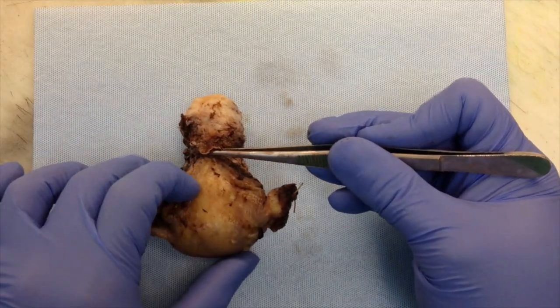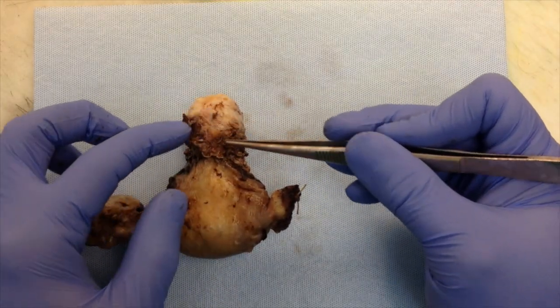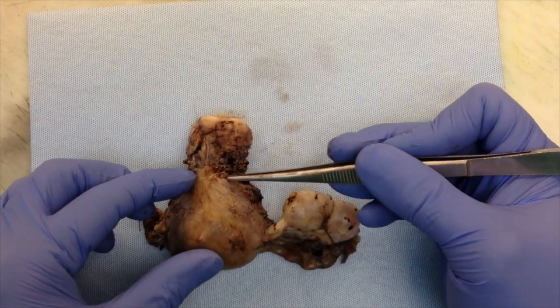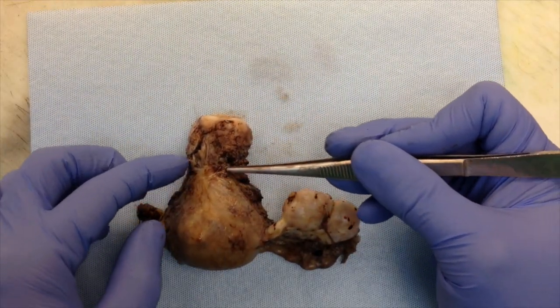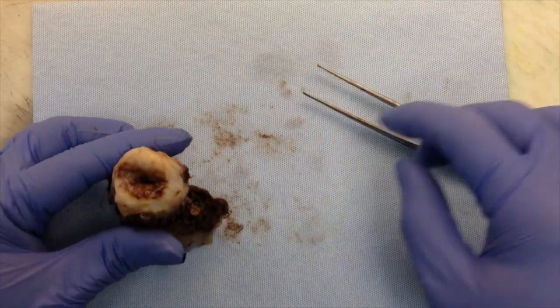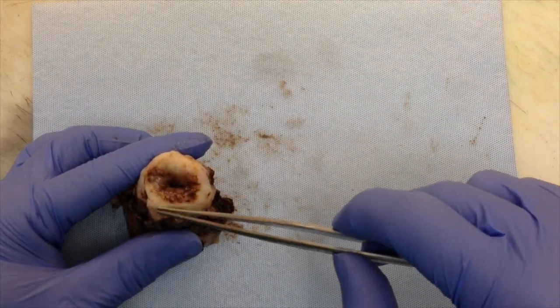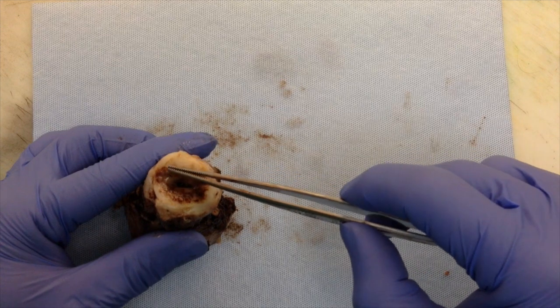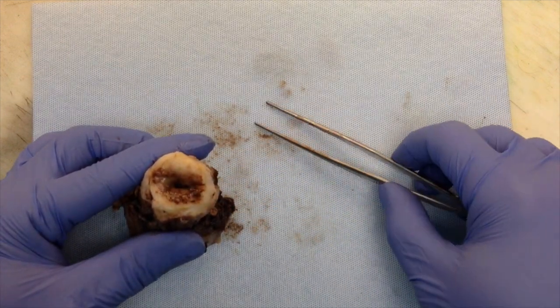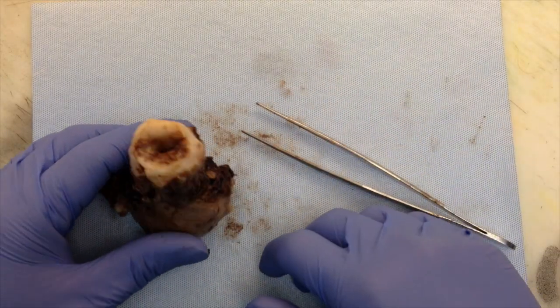So on the posterior, you'll see that the serosa comes further down, and it usually comes to a point. And when we turn around, it does that. See, this is the serosa, I'm following it, and it comes to a point and it ends right here. And then I describe the cervix. So this is the ectocervix, the squamous epithelium, and we describe the cervix and some area of tan-brown discoloration and no lesions. And then we're going to bivalve it, and we'll go from there.